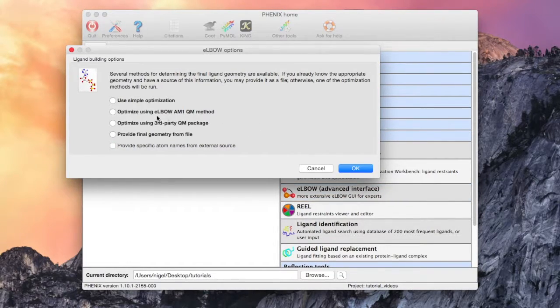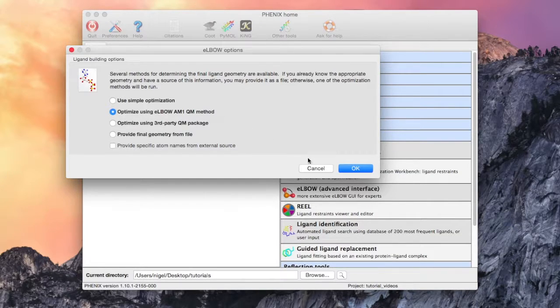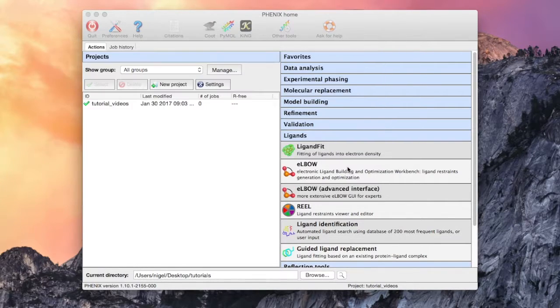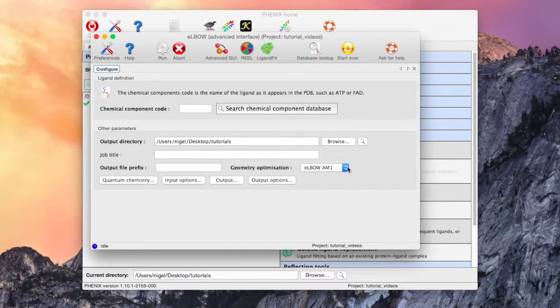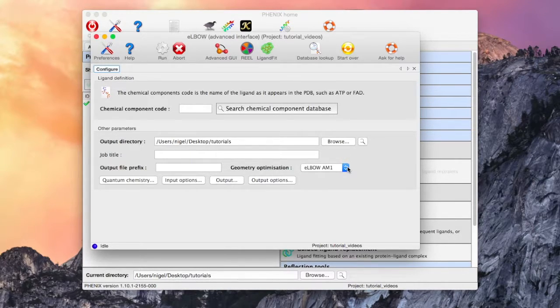Let's choose the AM1 option and OK. The final configuration screen has only those fields and buttons needed as well as a few minor configuration options that are always shown.